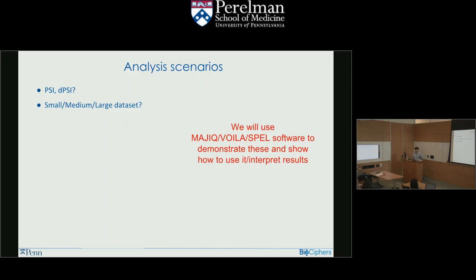Once you start defining replicates, there are some things you should keep in mind. We'll talk about that. Do you suspect that you have outliers in your data, or do you not have true biological replicates? Is one of your samples mislabeled? Are you dealing with more heterogeneous data? We'll touch on that. Do you have paired samples? Maybe you have patient data from two different tissues and you want to do analysis comparing those tissues within a patient and then generalize that across several patients in which you have paired samples. That's something we'll talk about.